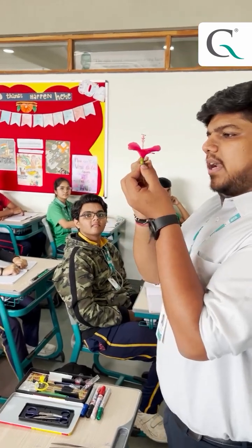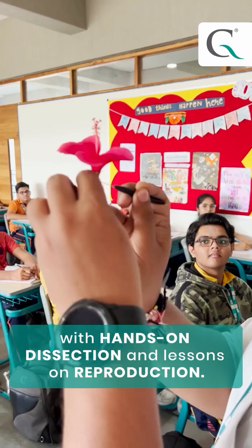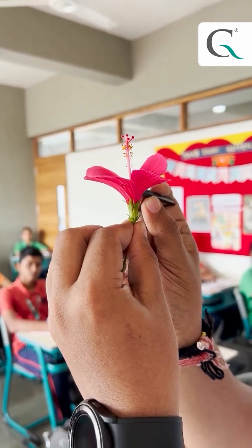We will prick it on; inside this we will prick it like this and just slide it up. So we are doing a TS, that is a transverse section of the flower.